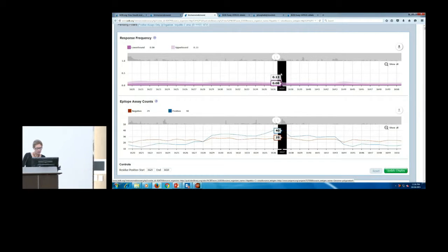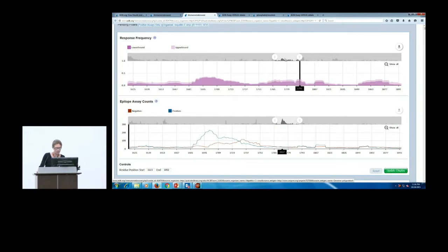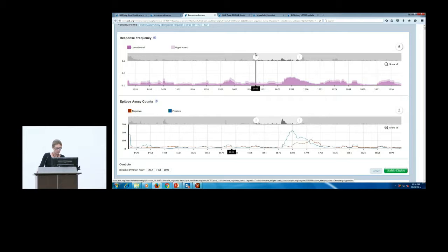Yeah, we zoomed there. Maybe I should zoom out a little bit. Yeah, so I think it was this area here that you were talking about. Does that look right? Yeah. So here, yeah, there's a very good correlation between the two pinks there. How many negative assays? There are 25 for the same spot.